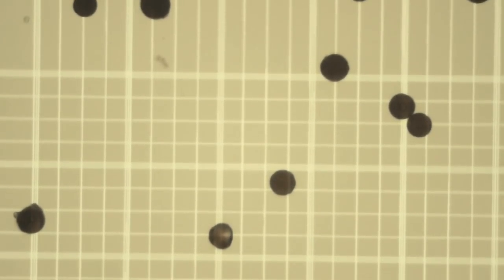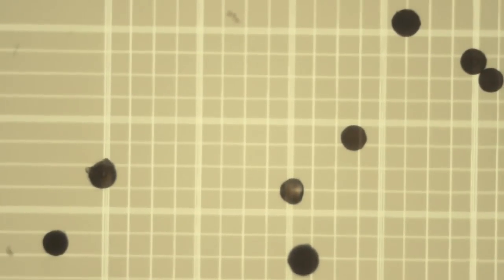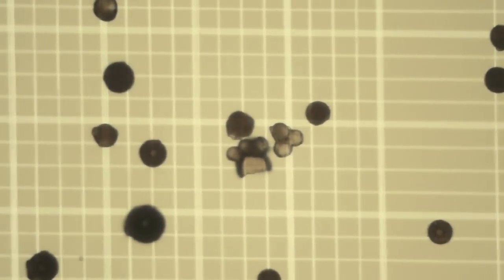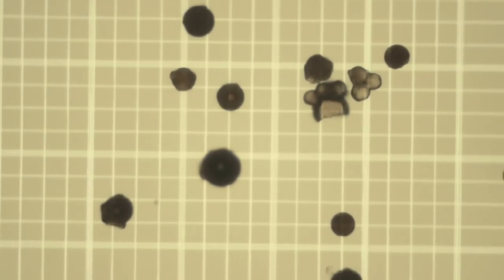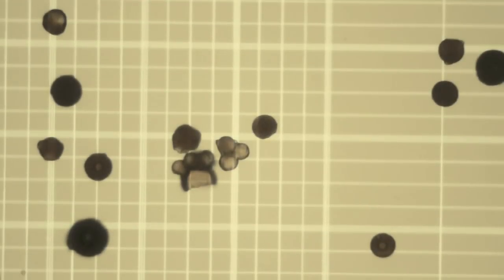Okay, so we go 1, 2, 3, 4. Not going to score that one. 5, 6. Artifacts, 7, 8, 9, 10. It's probably a cluster, but we're just going to score that as 11, 12. And that's it. The center contains 12.